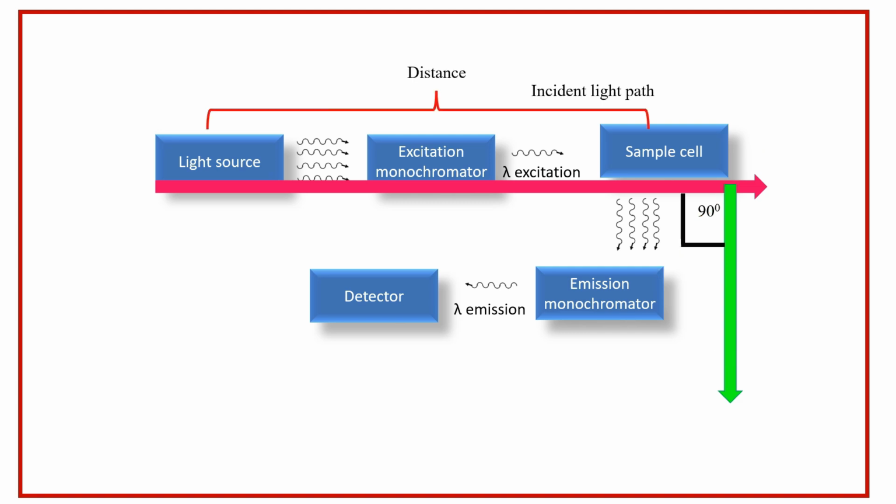Next is detector angle and the distance between the excitation source, sample and the detector. This is the distance between the excitation source and sample. These distances and detector angle also influence the PL intensity. So for multiple measurements, don't change anything if you want to compare the data.